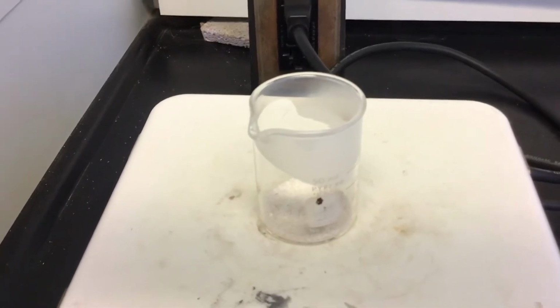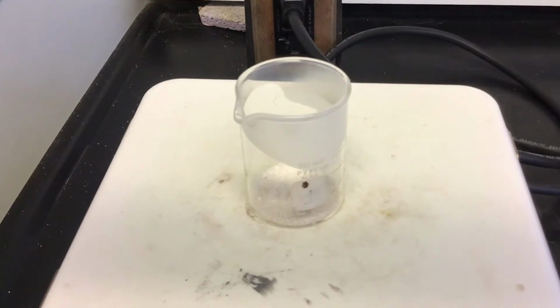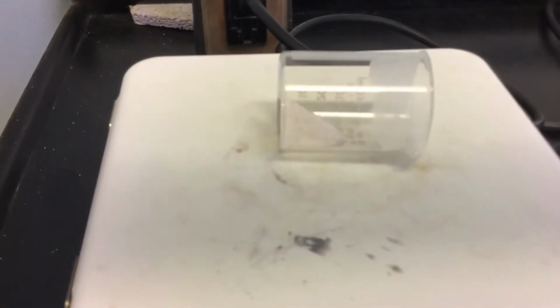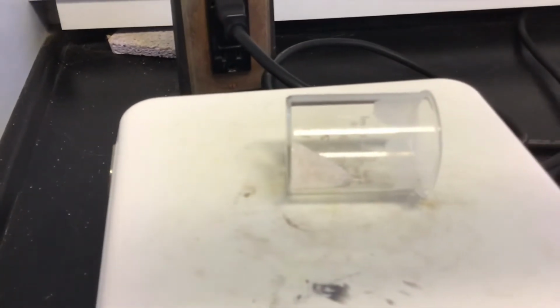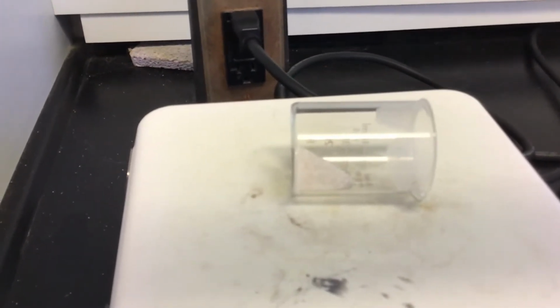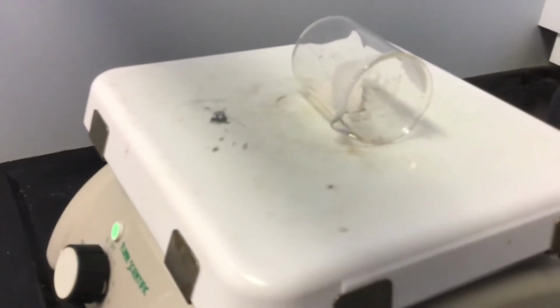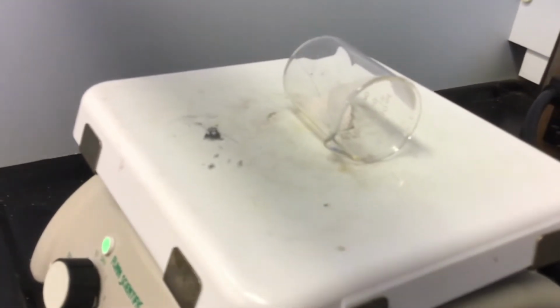Okay. So we're still waiting. We're doing good. We're making progress. So you notice it was on the edges. What we typically do is we lay it on the side, and then it gets it off the edges. So we just move the beaker around to get that white film. If you look at it like that, you can tell the part that's on the hot plate has gotten rid of the ammonium chloride.